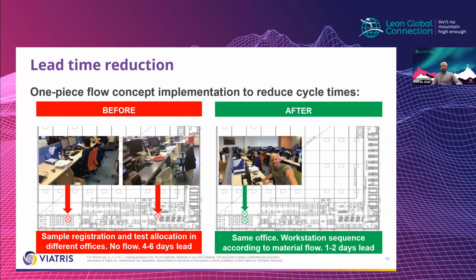So we conducted a deep dive analysis regarding faulty tests, revealing that almost 30% of the tested batches were involved in investigation, and nearly 50% of the preventable lab investigation reports could be caused by human error, and mainly the newcomers. So it is very important to know that these investigations really hurt. They consume a significant amount of resources.